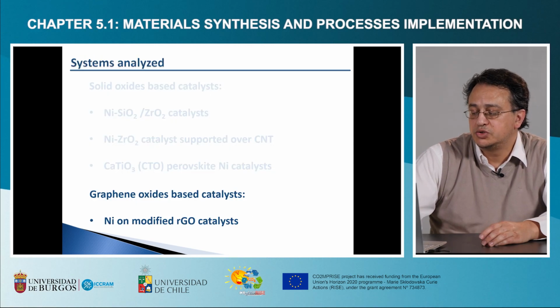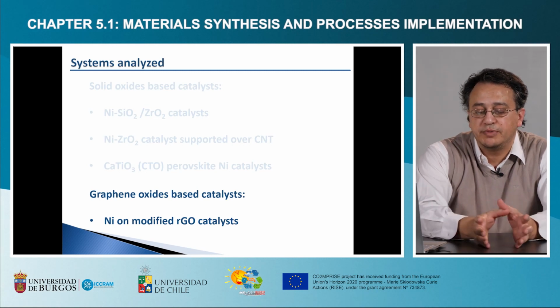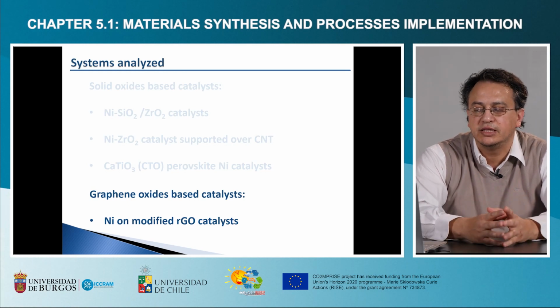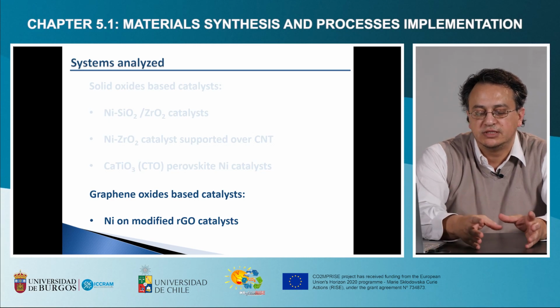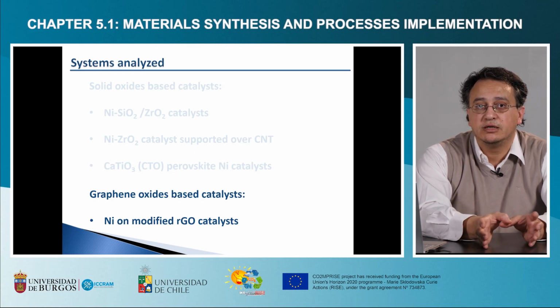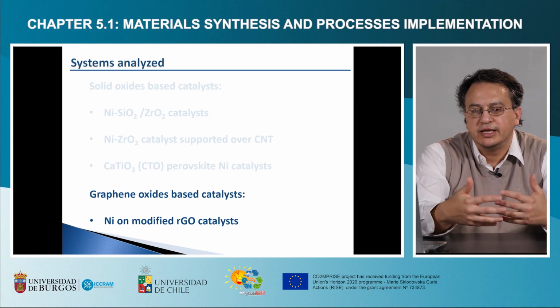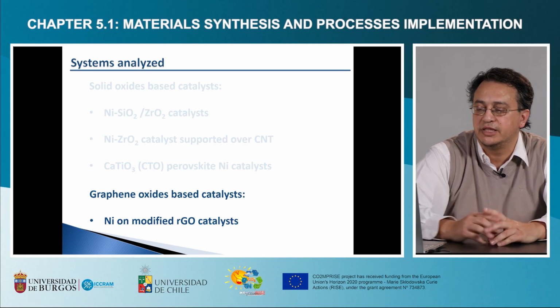But two different systems were used for that. In the first one, we have the crystals already prepared for the CTO, and we put the nanoparticles on it and see how they interact. And we went even further in such a way that we used a synthesis protocol called the sol-gel method, in which before preparing the CTO crystal, we already put the nickel precursor in. So we have a stronger interaction in that system, since the nickel is already doping the CTO material.